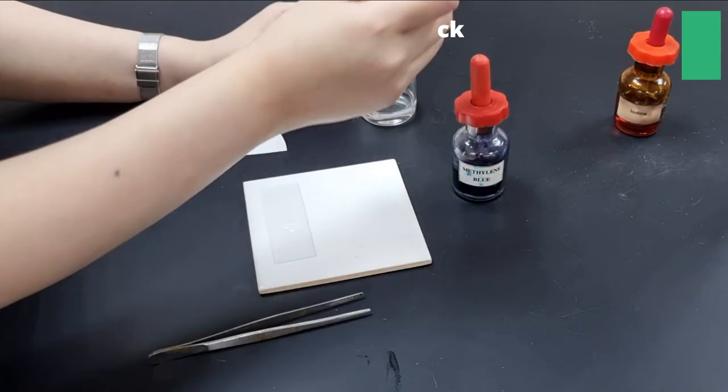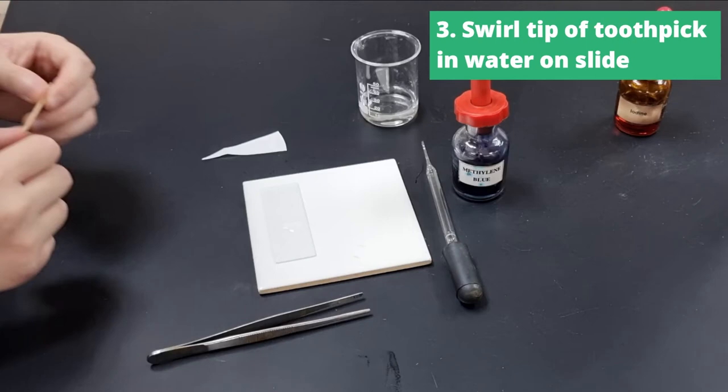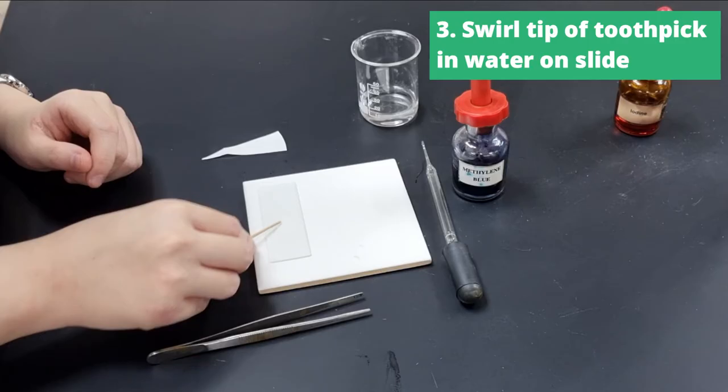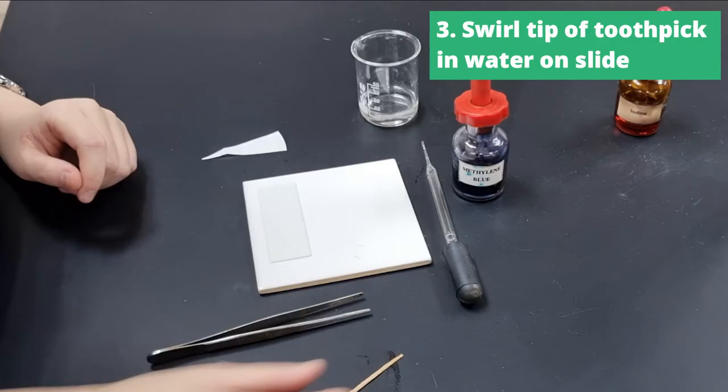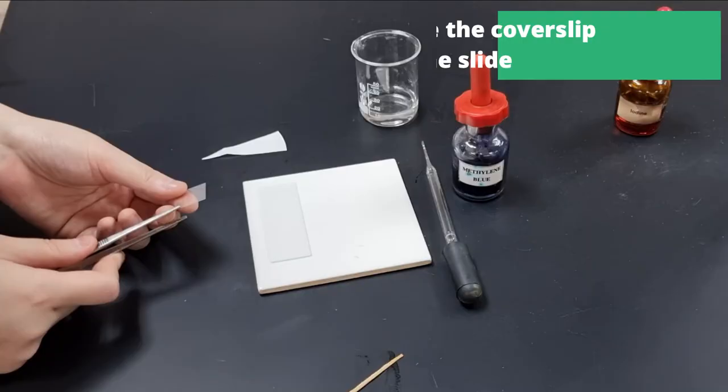And then we're going to take the toothpick you just used to scrape your cheek cells and put the tip in, stir it a little bit. Try and get those cheek cells into the water. Don't stir it too much though, because this will fragment the cells. You don't want that to happen. Just make sure the cheek cells are in your water.